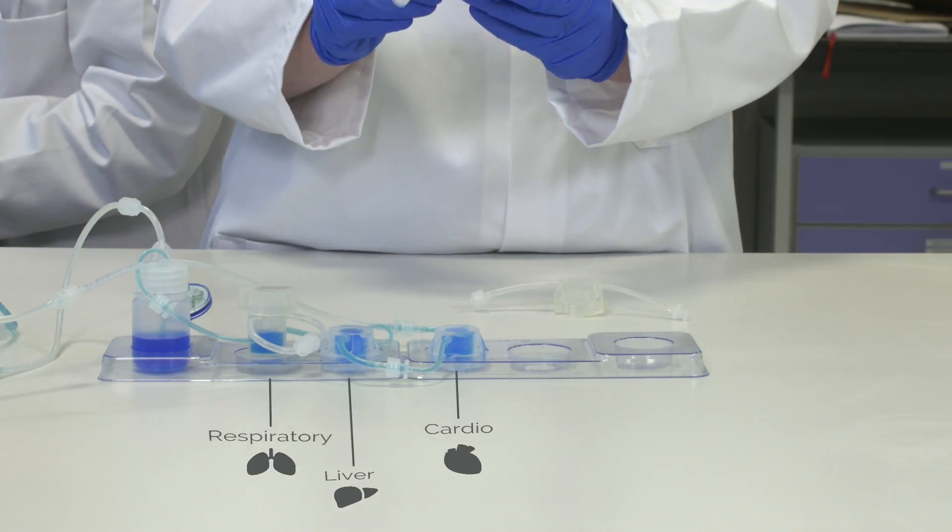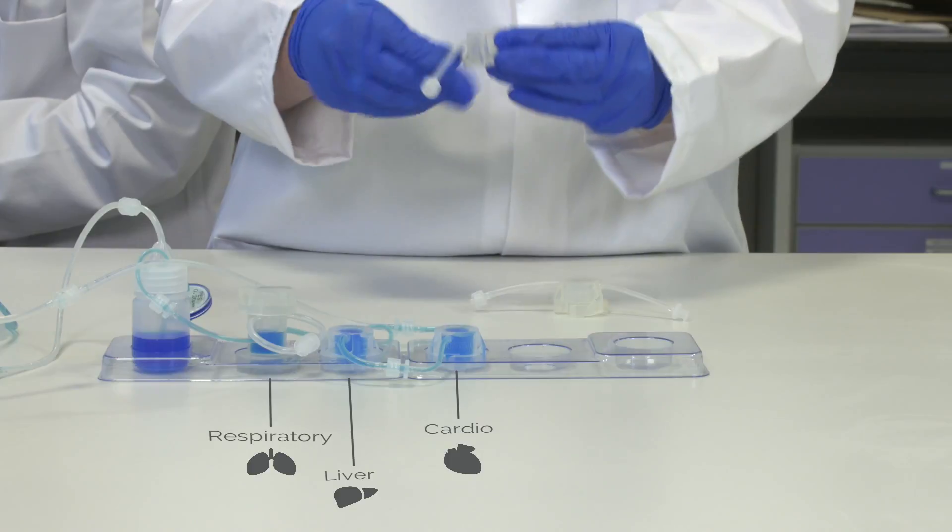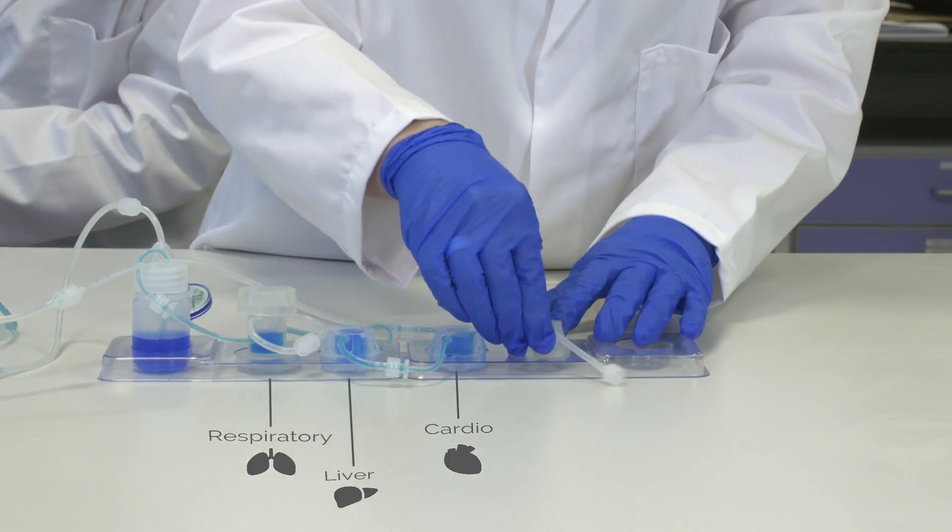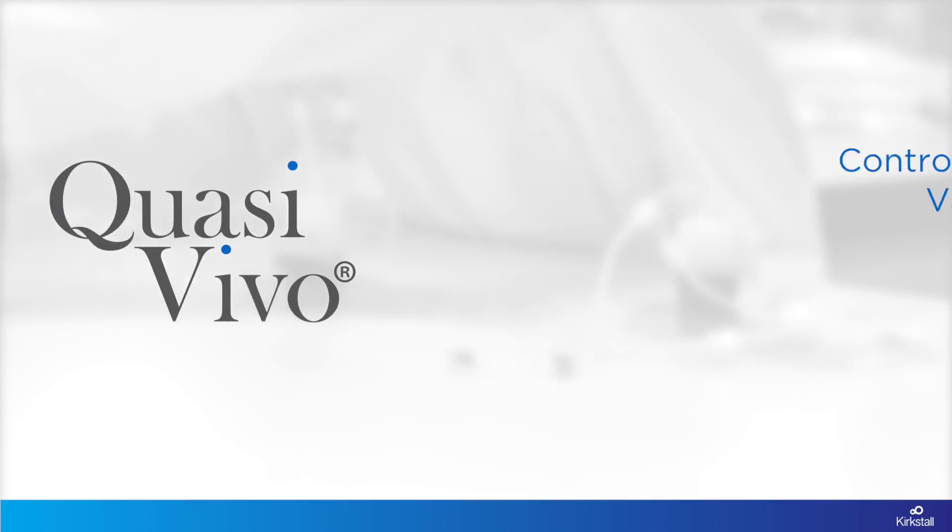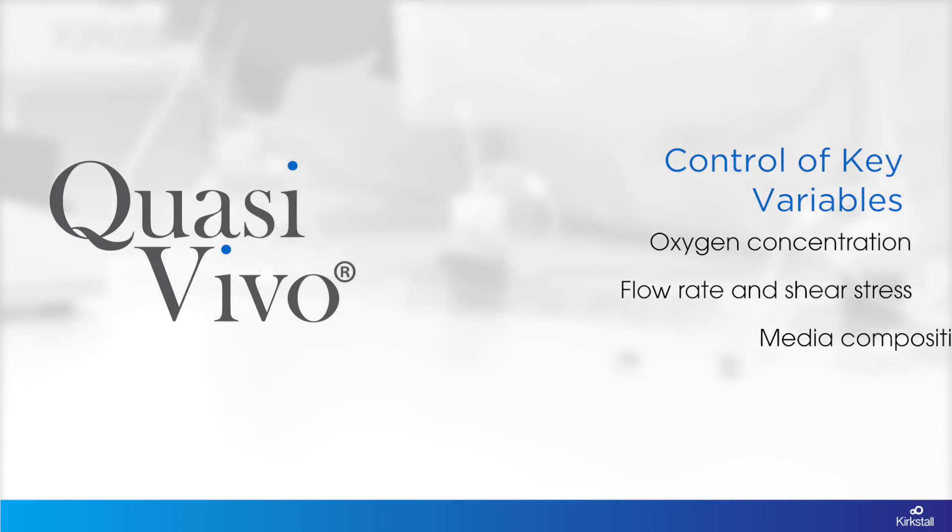Quasivivo chambers can be linked in series allowing for the setup of extensive co-culture models. Quasivivo also gives you close control of multiple variables, allowing you to predict and then achieve the optimal environment for your research.